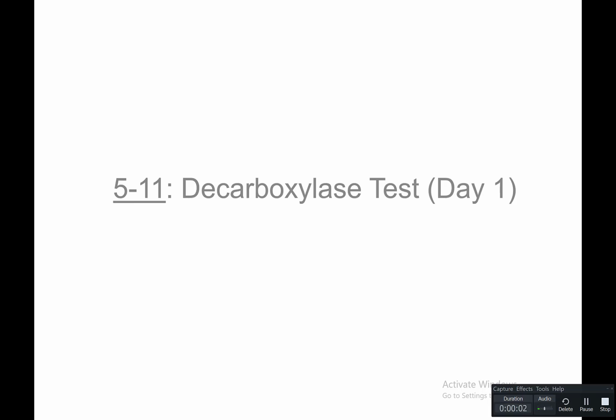So in this video, we're going to talk about a decarboxylase test, and we're going to start with day one, which is the setup of this test. And this can be found in your lab book with activity 5-11. And so let's talk about how we would set this test up.